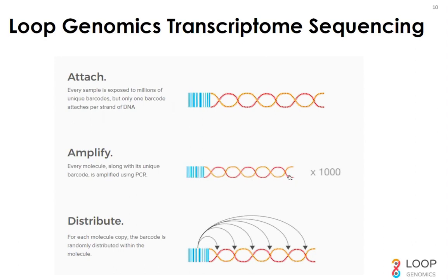Now each mRNA molecule that has a unique sample index and a unique molecular identifier is present in the sample in multiple copies. And just to remind you, at this stage, all the samples are already multiplexed into a single tube. So in this reaction, where we amplify the cDNA, we already have 8 or 24 or 96 samples multiplexed into a single tube, and we're just 45 minutes into the prep.